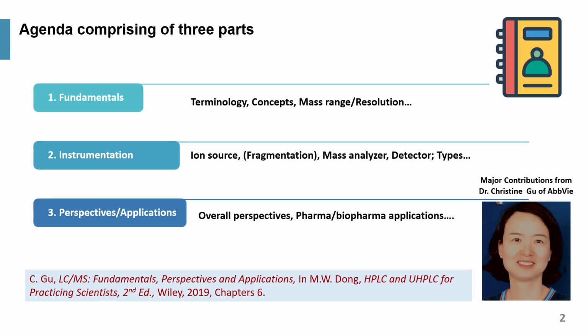Here's the agenda comprising three different parts. First one is fundamental, covering terminology, concepts, mass range, and resolution. Second, instrumentation, speaking on ion source, fragmentation, mass analyzer, detector, and different types of mass specs. Finally, perspective and application, focusing on pharmaceutical and biopharmaceutical application.